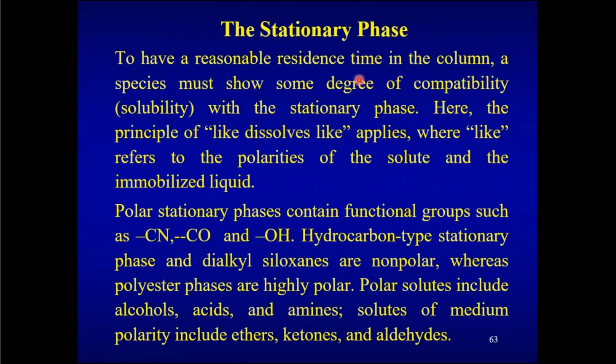To have a reasonable residence time in the column, a species must show some degree of compatibility. Here it refers to solubility with the stationary phase, because we are dealing with a liquid stationary phase. That's why it refers to solubility. Here, the principle of "like dissolves like" applies, where "like" refers to the polarities of the solute and the immobilized liquid. Like I told you, a polar solute retains strongly on a polar liquid phase.